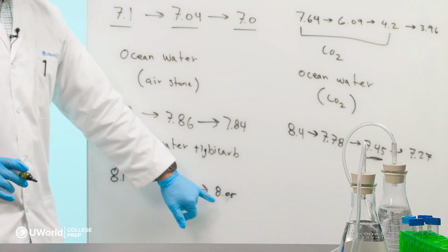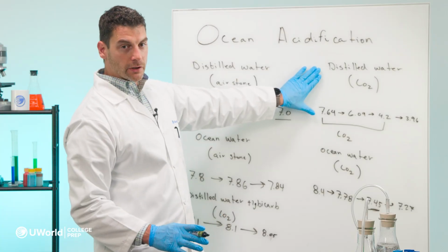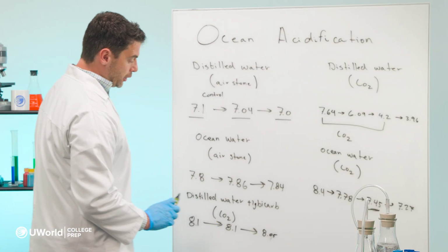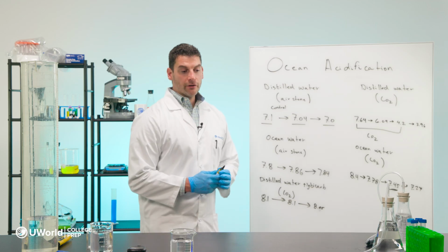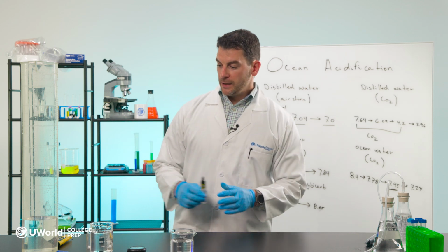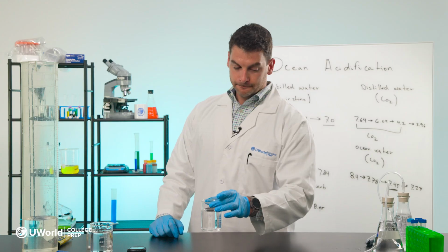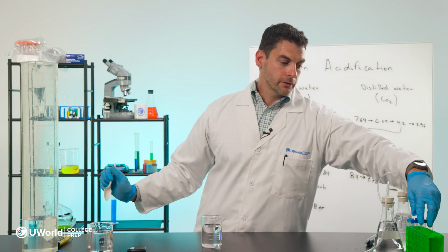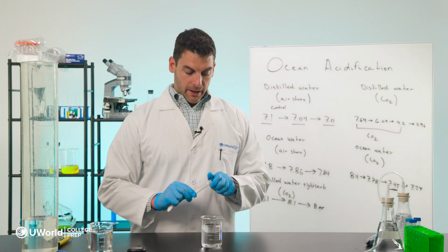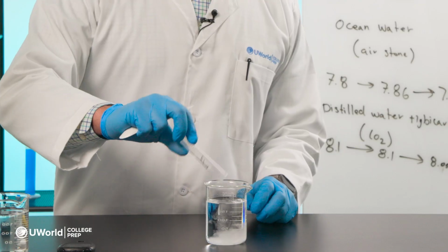So overall, there was some change, right? But the change is relatively minor when we compare it to our distilled water that we had up here without the bicarbonate. So now let's do the final part of our experiment, and that is to do the same thing. We're going to take now our salt water, and we are going to dissolve our sodium bicarbonate in it, and then we will add our CO2.